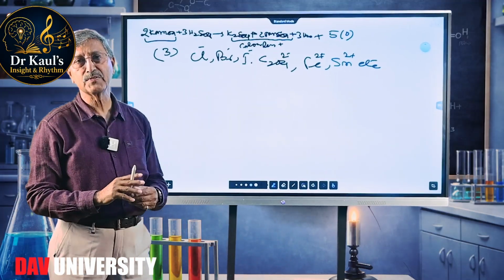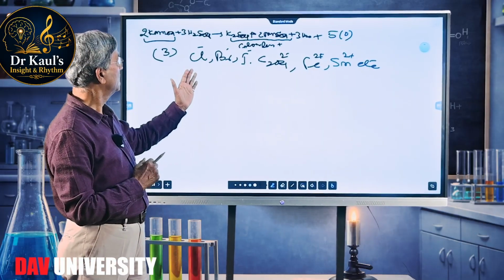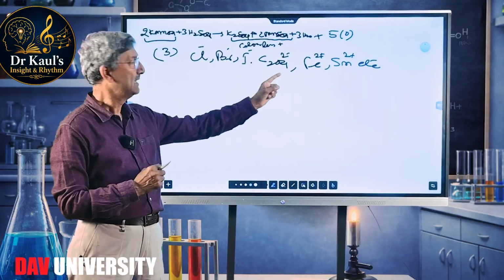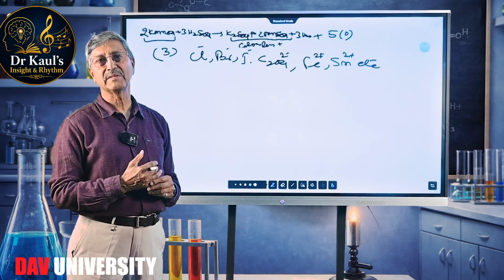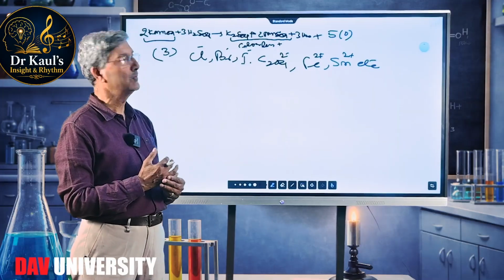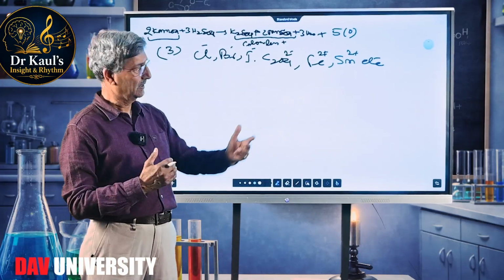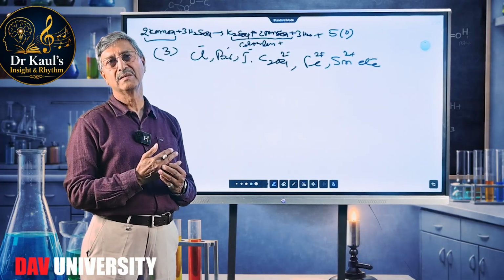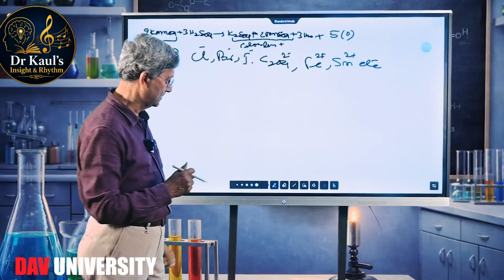So in this way, viewers, this is a small test, but this gives us indication regarding the presence of these ions, the chloride, bromide, iodide, oxalate, and these are the ions which in fact will be detected by concentrated H2SO4 test as a preliminary test, and subsequently they will be confirmed by their confirmatory tests. Similarly, these cations, if indicated in this test, then of course while doing the analysis of the cations, we can further confirm the presence of these cations.